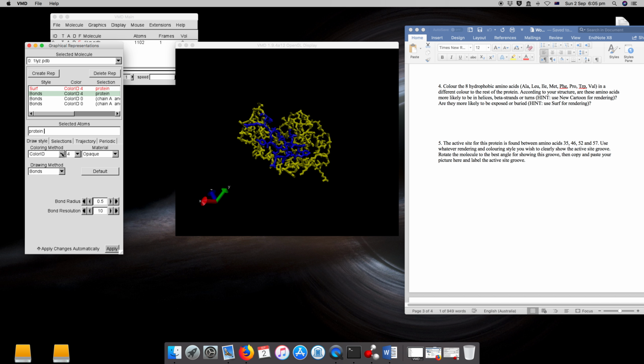Okay, maybe see if I can make this new cartoon. So you can play with this as you like, as long as it shows what you need to show.